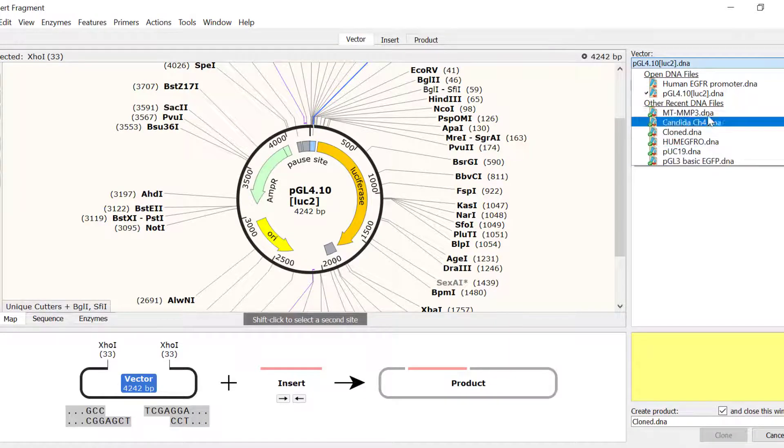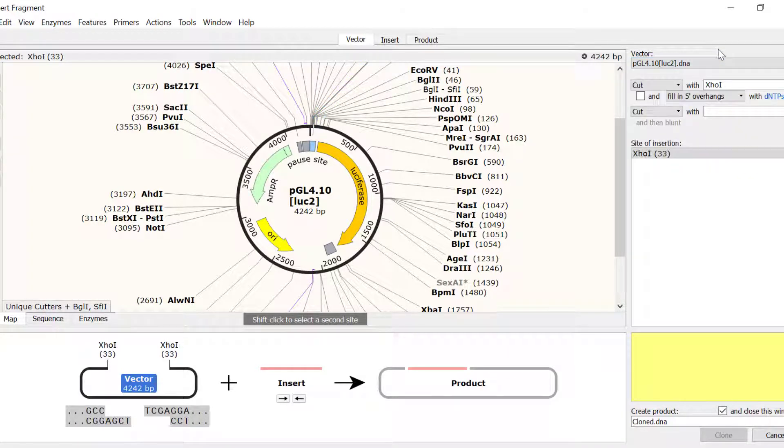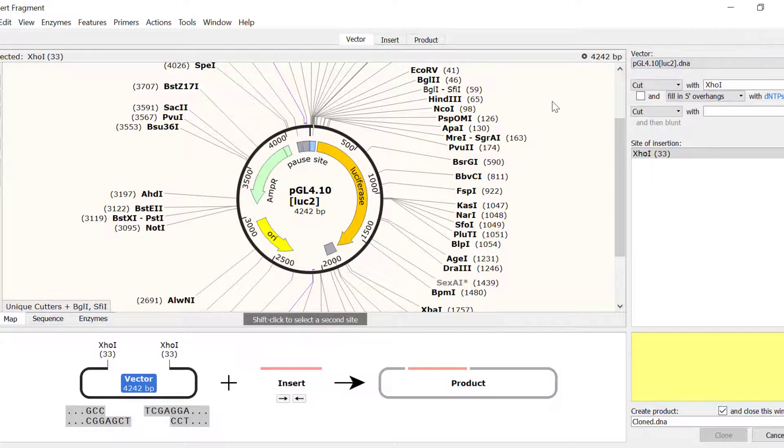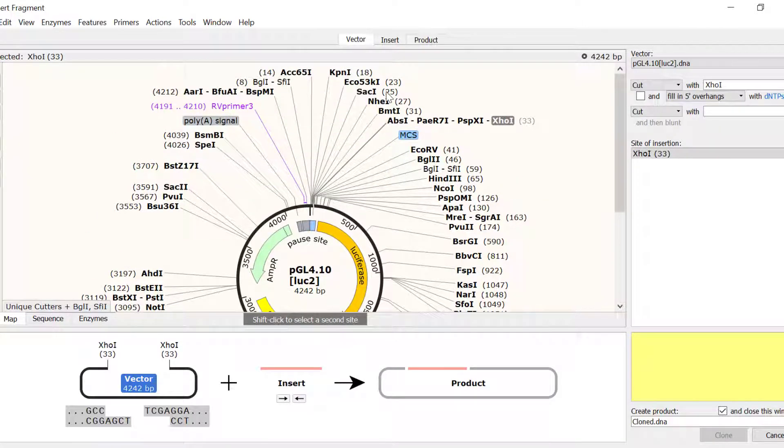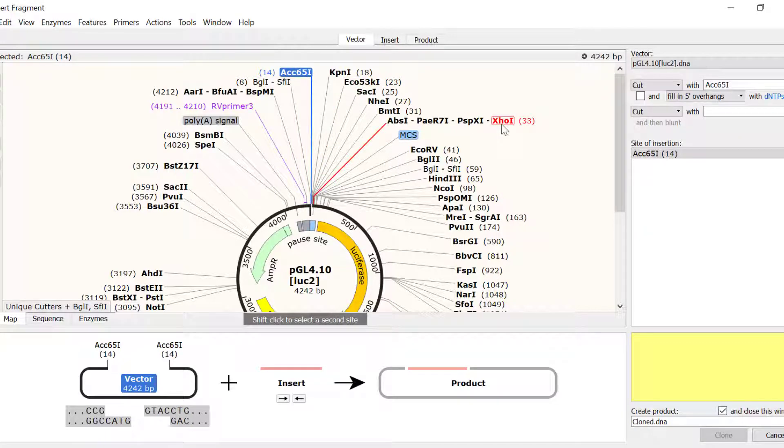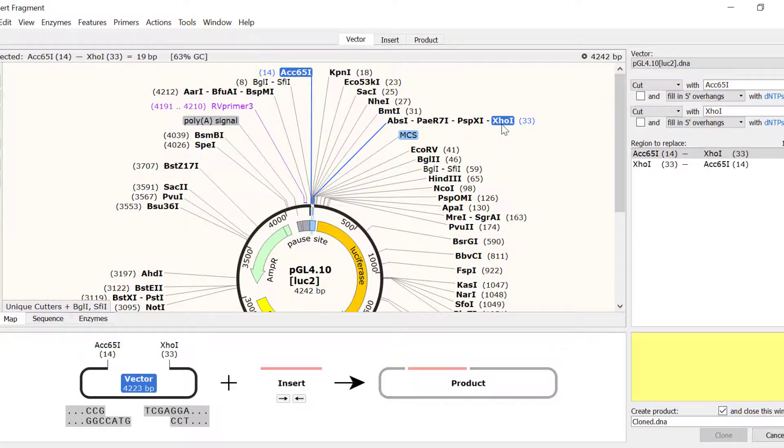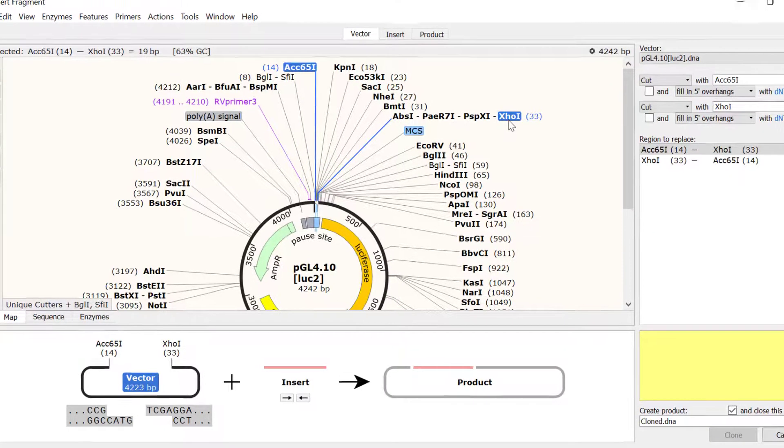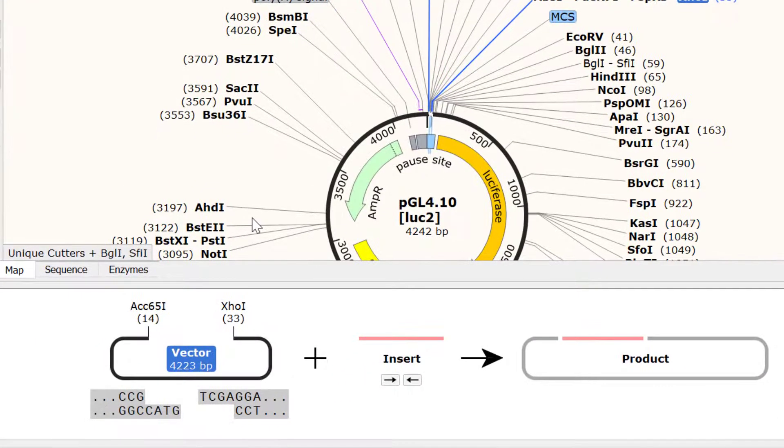Next, we need to select the two restriction enzymes. I will firstly click on ACC651 and shift click on XHO1 to select the desired region. The schematic below is now showing the sequence with the overhangs.